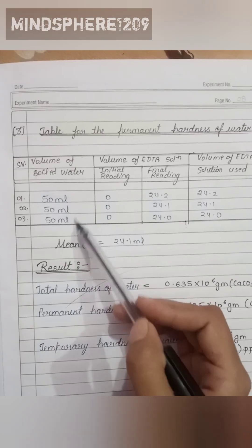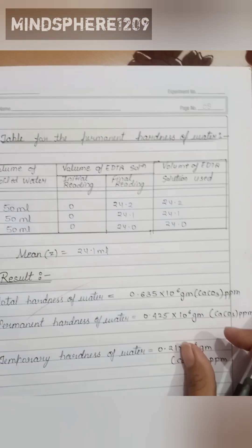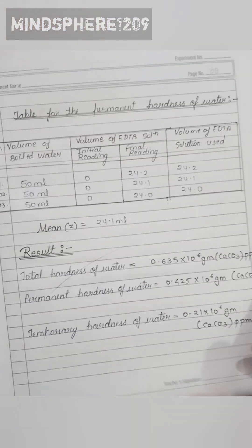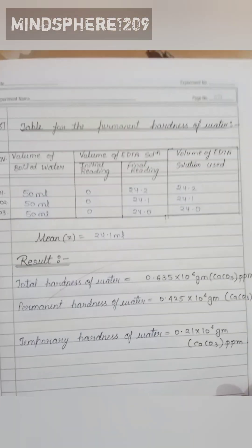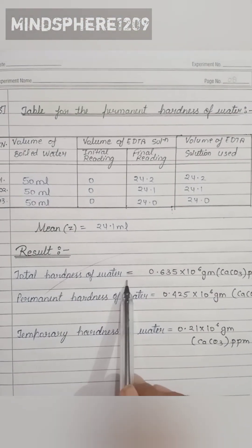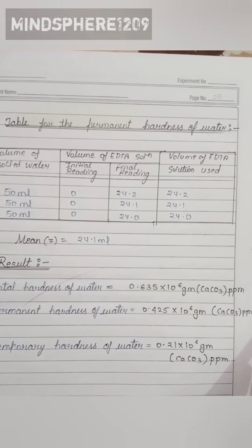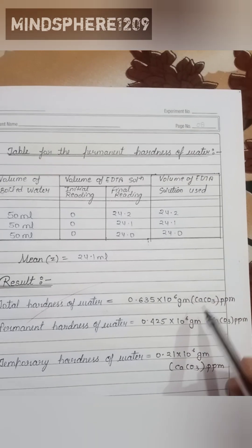For the permanent hardness table, we take 50 ml of water, with an initial reading of 0, and record the final reading and volume of EDTA solution used. The mean value is 24.1 ml. The result: the total hardness of water is 0.635 × 10⁶ grams of calcium carbonate parts per million.